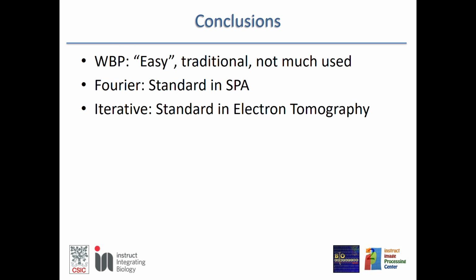But for instance, these iterative algorithms also allow priors, and we have seen all these soft thresholding or all these proximal operators, iteratively constraining the reconstruction to have some nice properties like being smooth or whatever, and how they impact the quality of the reconstructed map.